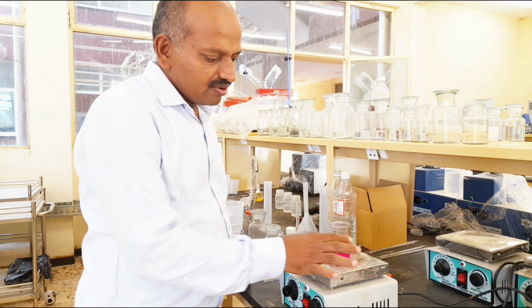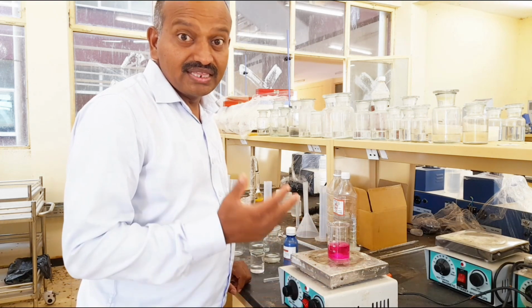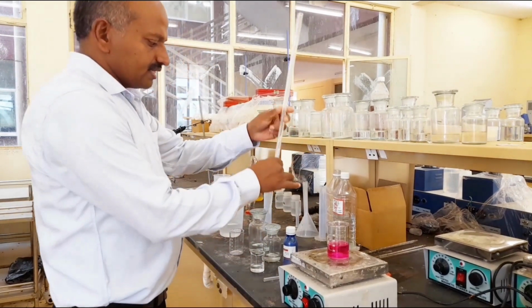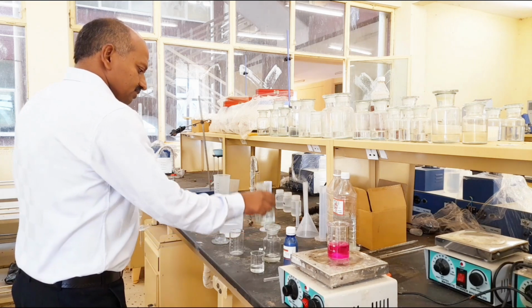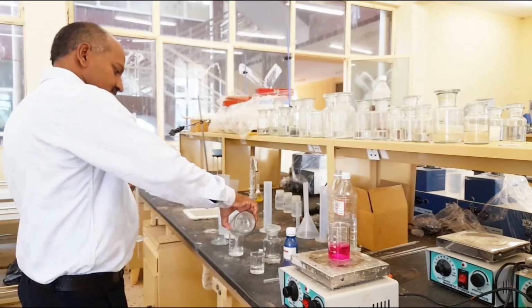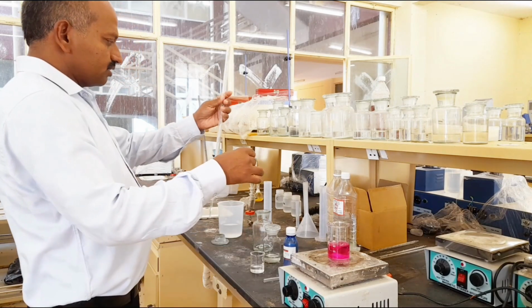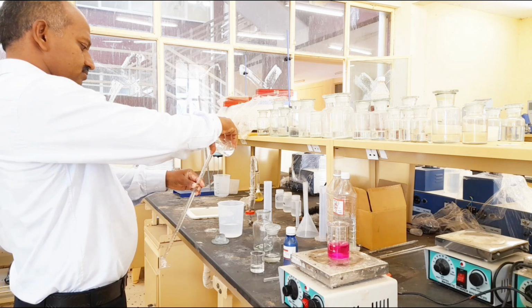Now we will titrate with the acid and see how the color changes and when the reaction ends. Right? So now I will take the acid into this burette. This is the acid of known strength.